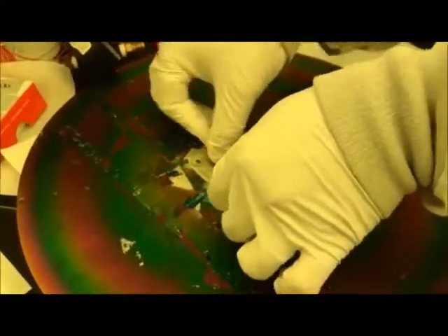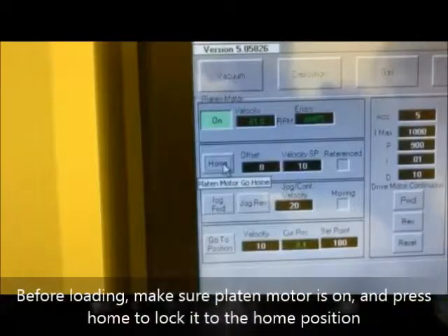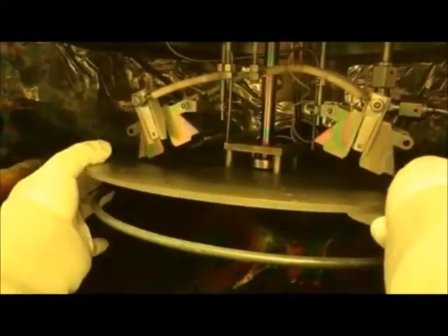Yep. So we are loading the sample outside. We just use the Kapton tape to tape our sample down to our sample plate, and then we'll flip it upside down. Make sure this guy is facing this way, and you can see those two holes. Those two holes will go into these two poles. Once it's fit in there, these two holes should match those two poles.